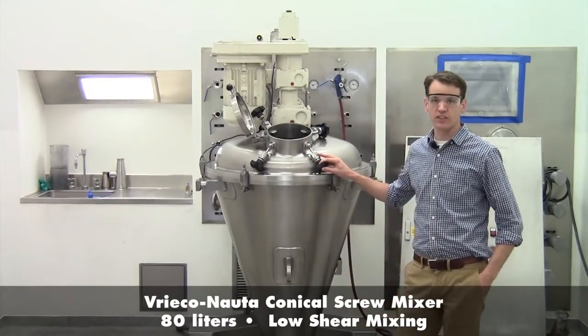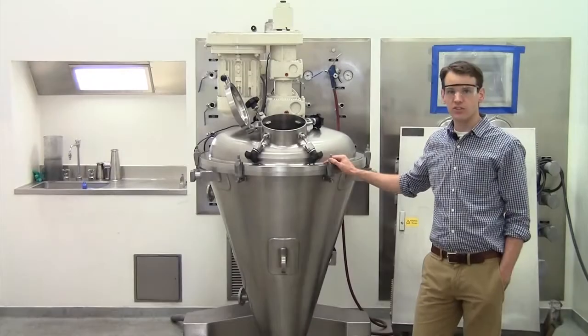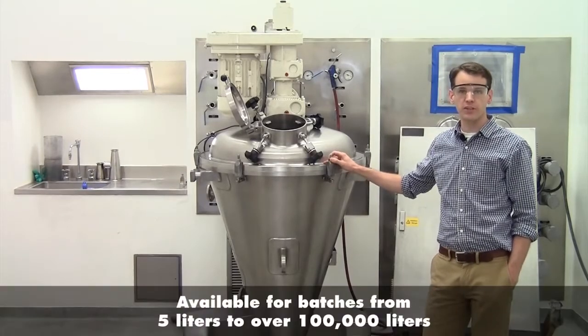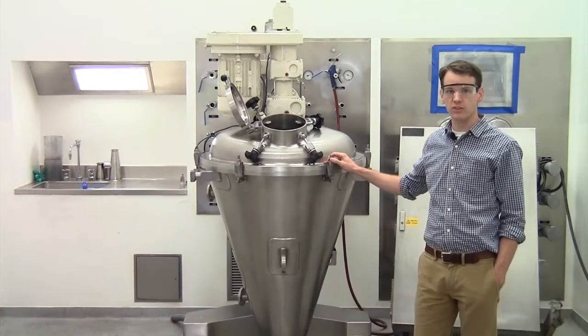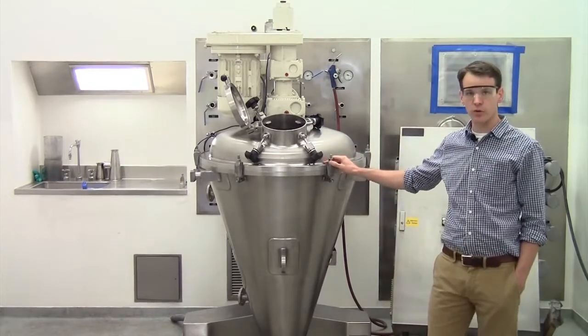This here is our 80 liter unit. This is a low shear batch mixing technology used to mix powders and granules, and is available from 5 liters up to over 100,000 liters. Today we'll be using the model 80 LDC41 from our test center.